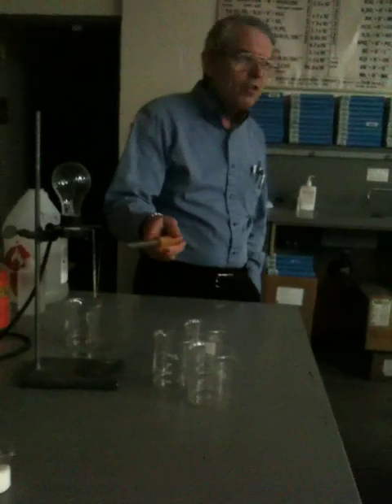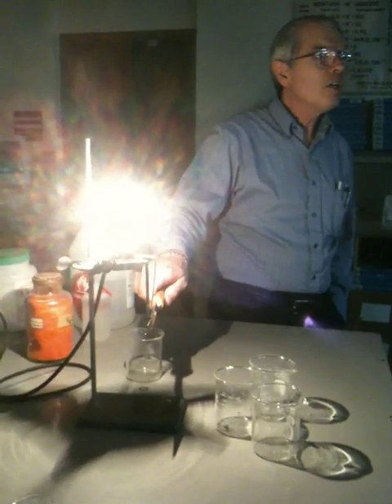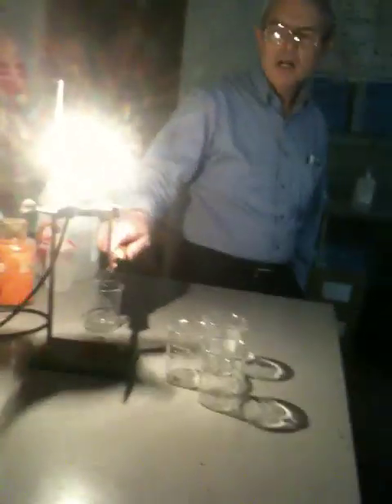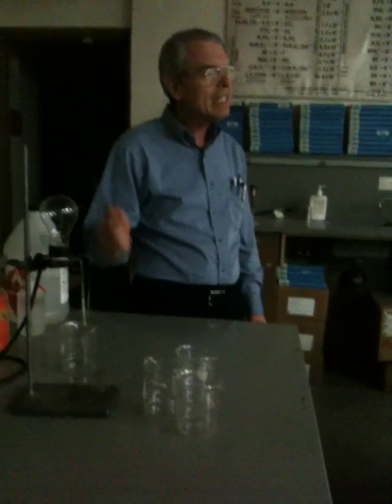What you're looking at right now is a light bulb that's plugged in, but it's not working. Why? Because the circuit is not complete. When I do this, I'm completing the circuit. I am not generating electricity. A lot of people look at this and say you put the water up there and you get electricity. No. This is what's called a conductivity tester.